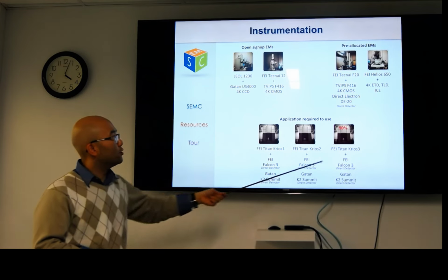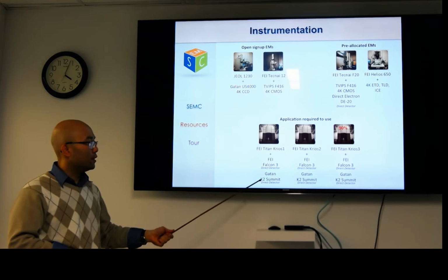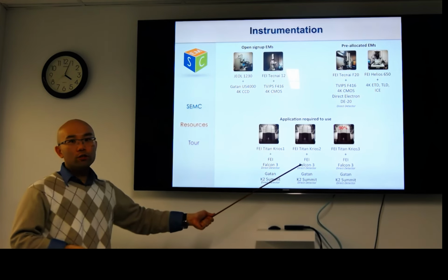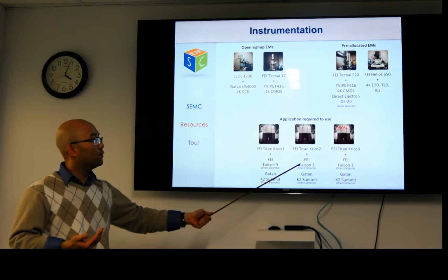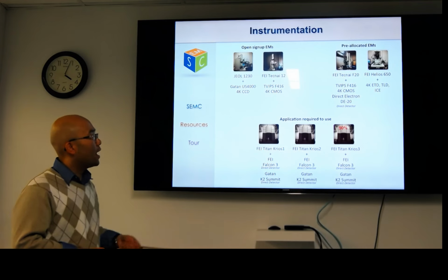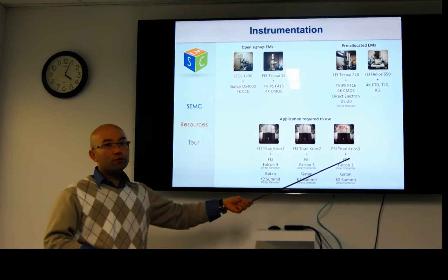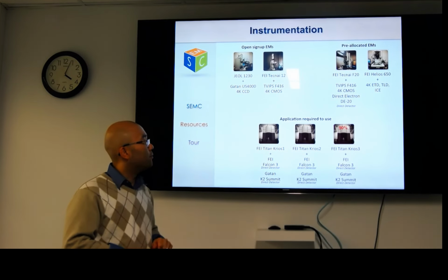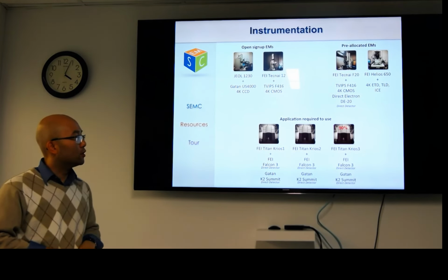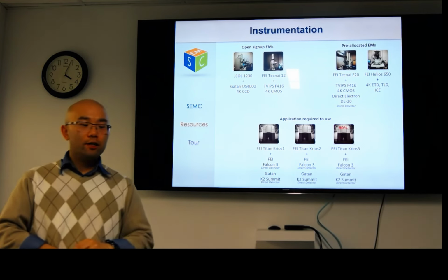We have 3 Krioses on site. Krios 1 has been up and running for a year. We have both the Falcon 3 direct detector and the K2 on it. That's just the normal Titan microscope. Krios 2 is just coming out of testing. Perhaps within the spring we'll be able to get out of beta testing. That has a Cs corrector, phase plates, and an energy filter. Krios 3 was bought by Columbia. We have half the time on that, and that has phase plates and an energy filter. Right now it has a Falcon 3 and K2, possibly going to be upgraded to the K3.